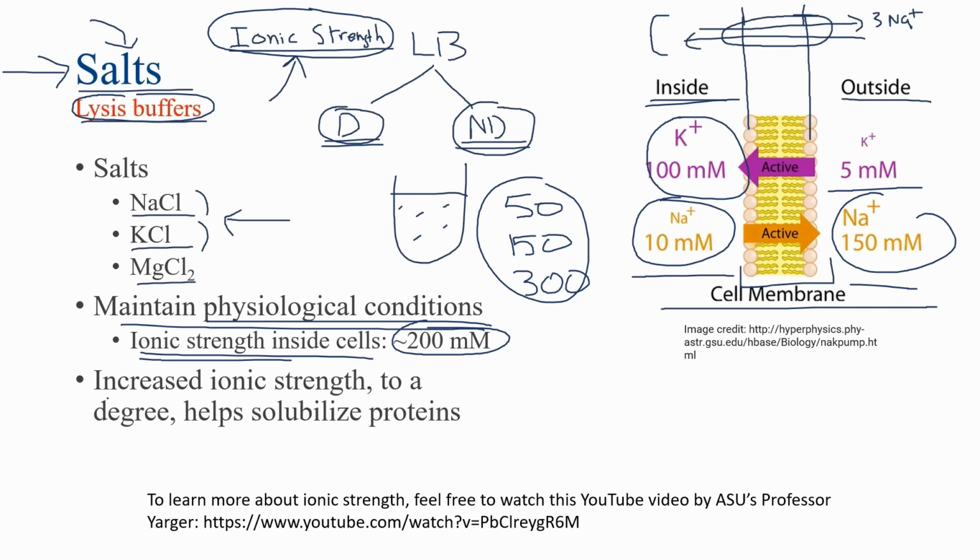Now, importantly, increased ionic strength to a certain degree will help solubilize the protein. So when we take a look at the cell lysate here, for example, and let's assume that these dashes are proteins, when you have different ions inside the cell lysate, these will keep the different proteins away from one another, meaning they do not aggregate onto one another. Now, ironically speaking, when you have the ionic strength at very high levels, the proteins will actually aggregate in the cell lysate. So keep this in mind.